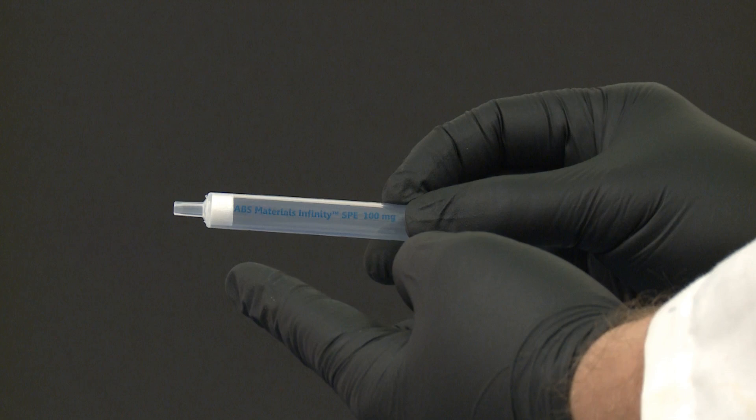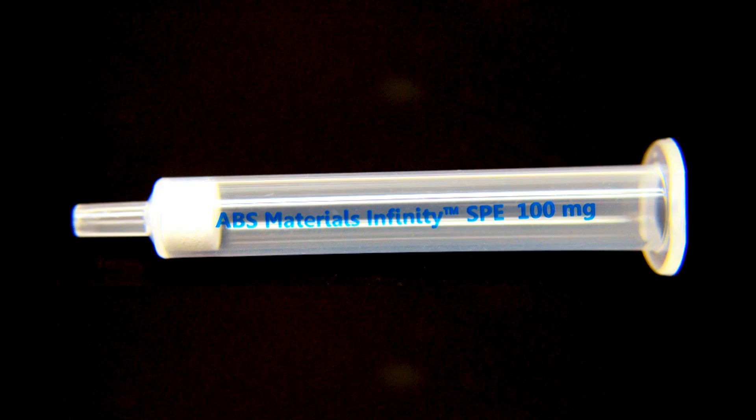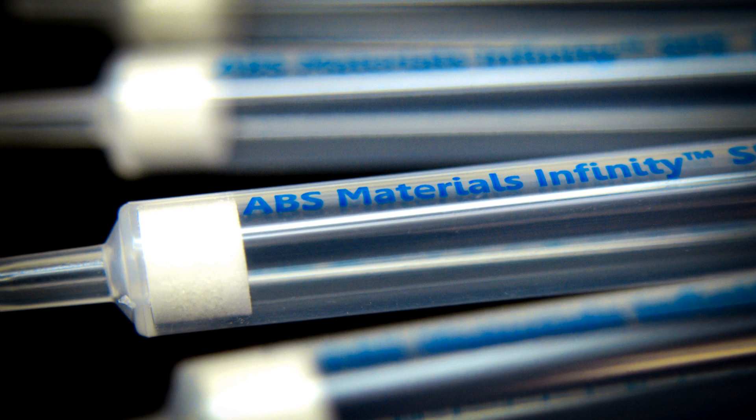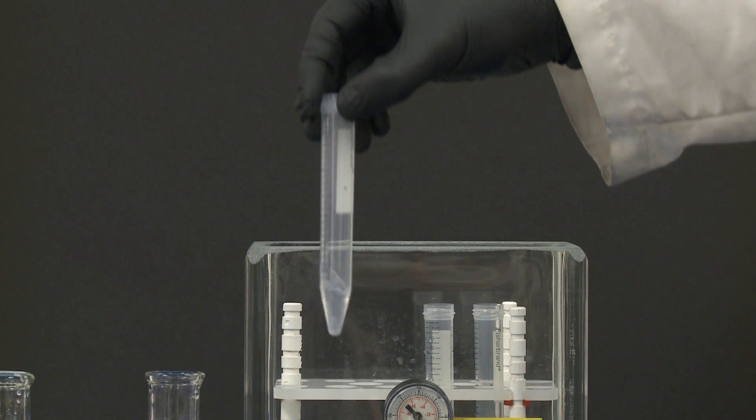The Infinity SPE cartridge is so efficient at capturing suspended solids that it is the only cartridge on the market that does not need a pre-filtration step, saving time and eliminating the loss of analytes during filtration.